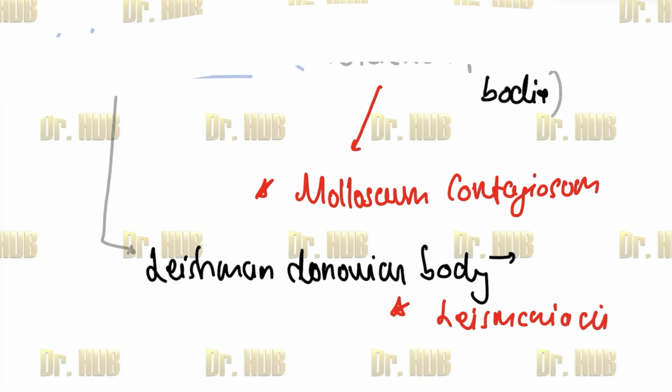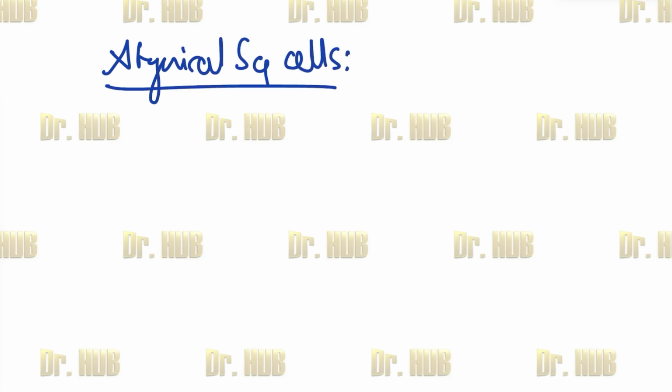Next, moving on, we look at atypical squamous cells. In case of atypical squamous cells, it is nothing but the squamous cell carcinoma.